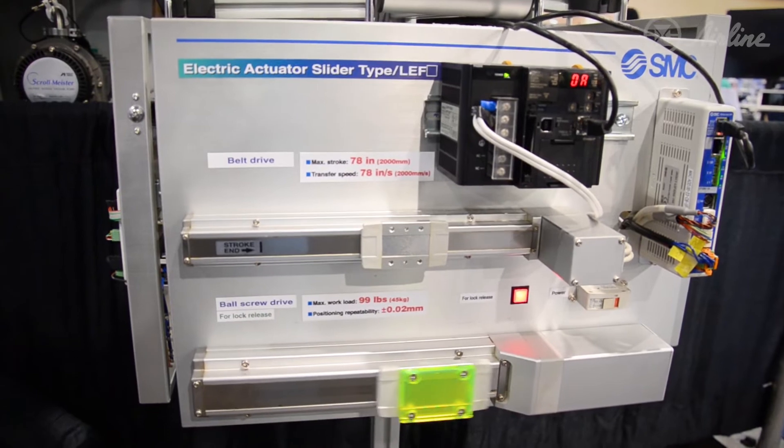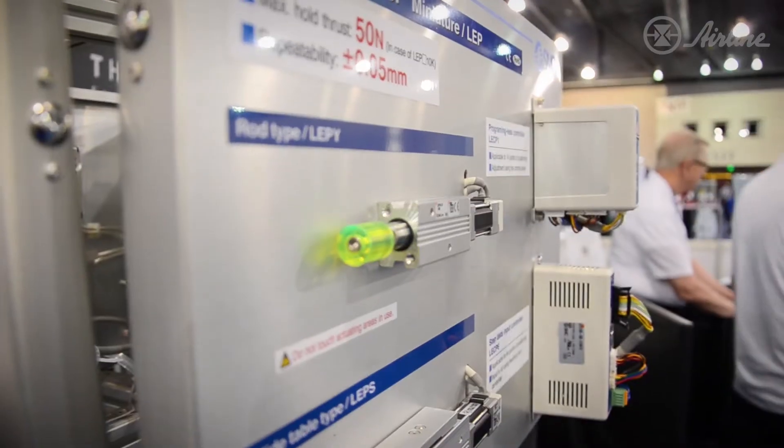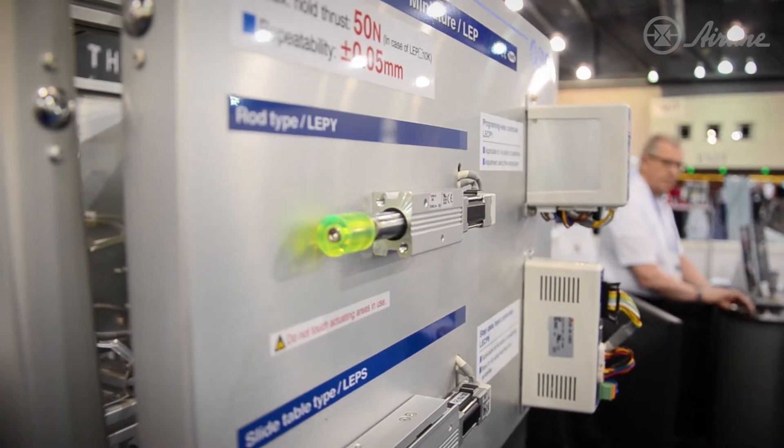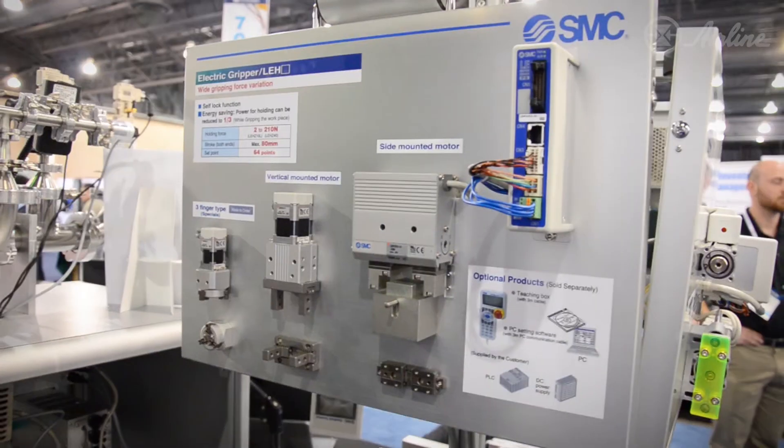As you can see here on the electric slide, you can program in pushing forces and you can also program in speed and acceleration. And lastly, we have the electric grippers.